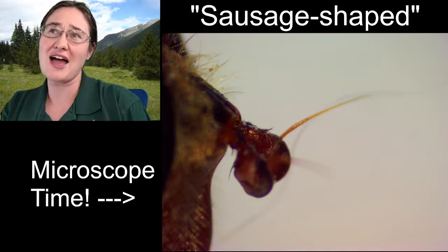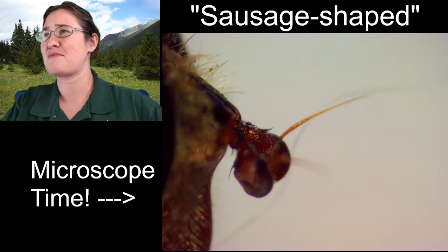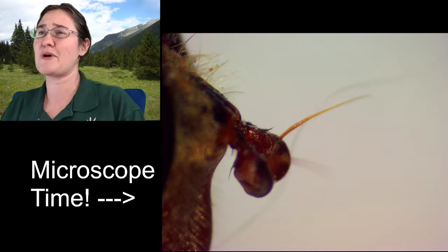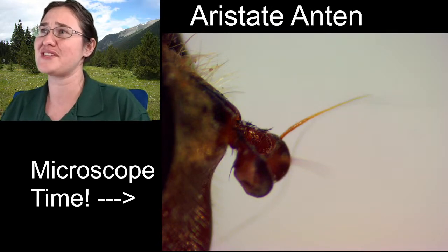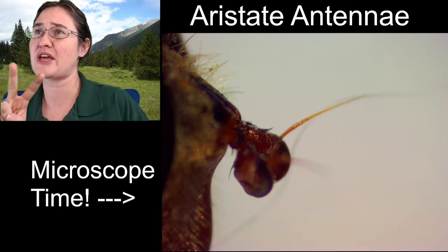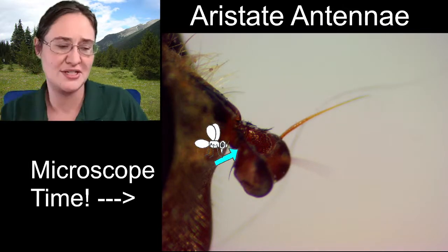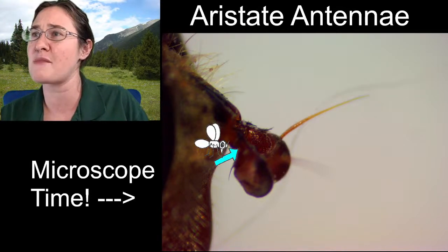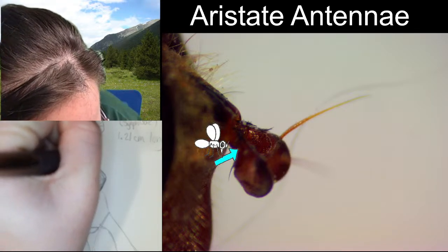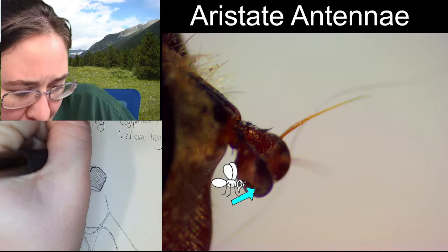Now, on fly antenna, I'm not sure exactly about the scape, pedicel, flagellum type thing. They're kind of their own type of antenna. So they're sausage shaped, but the scientific name is what we call an aristate antenna. All right, what you're seeing are two segments. There is a base segment that would be right around here. It's this kind of rectangular segment, and it does kind of come off of that stem. So if we come right here, you've got one little rectangular segment here. And then there is a second segment that's very bulbous.